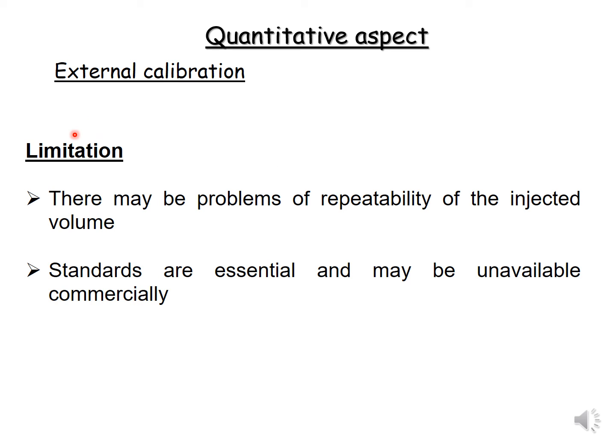So of course there are limitations to using external calibration, because you need to be sure that the area is proportional to the concentration. And sometimes this is not the case, because there may be problems of repeatability of the injected volume.